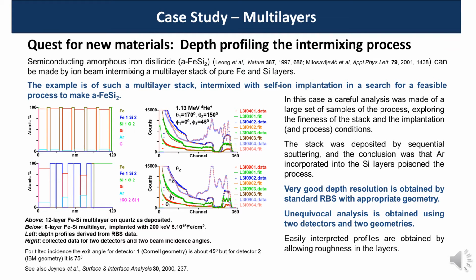Now we're going to look at some case studies. These can be seen on the case studies section of our website, so we won't spend too long on any of these. But what they do is they show the power and flexibility of ion beam analysis and how it can be used across many different fields.